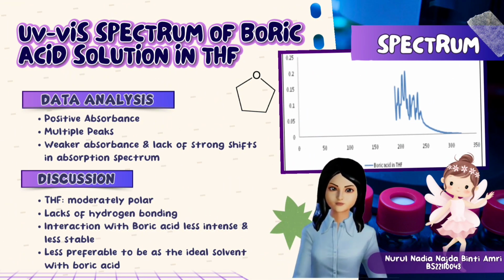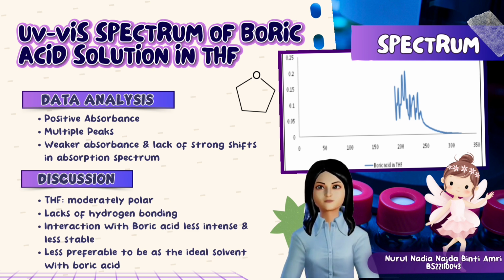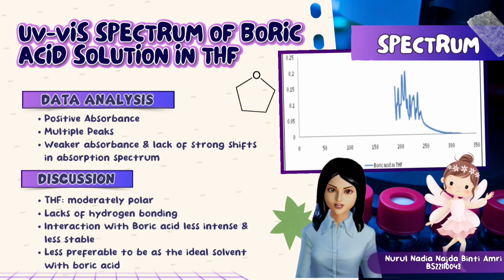1. By looking at the spectrum given, it is noted that there were positive absorbance and multiple peaks in the data obtained. 2. It explains the weaker absorbance and lack of strong shifts in the absorption spectrum. 3. From that observation, it is due to the polarity of the THF itself, which is moderately polar. 4.